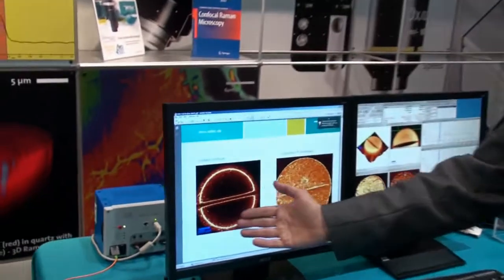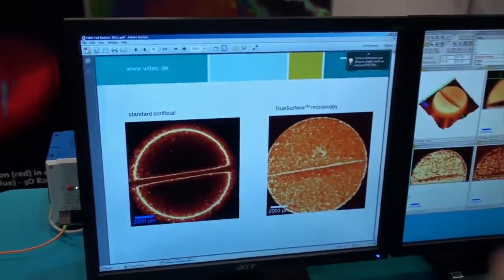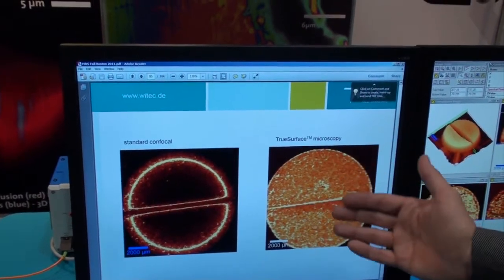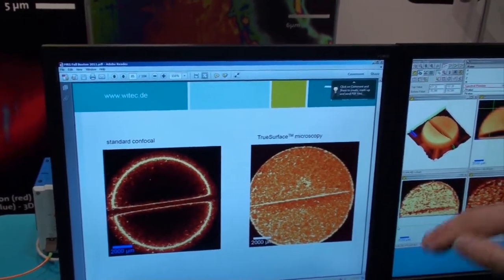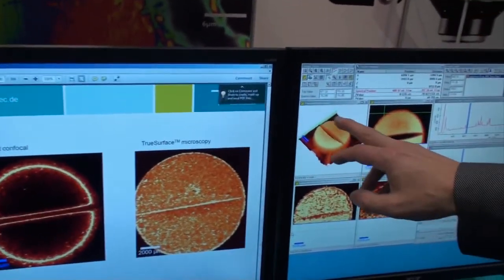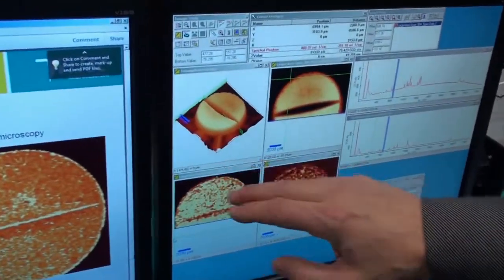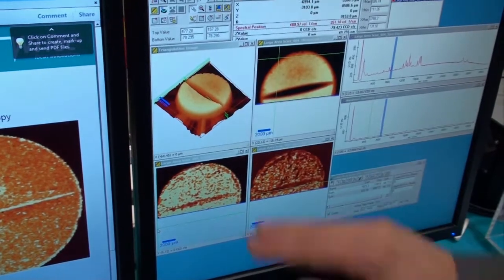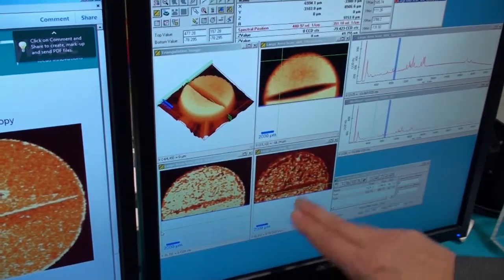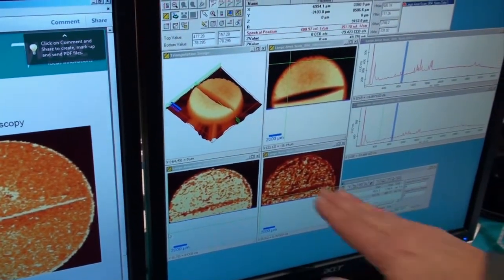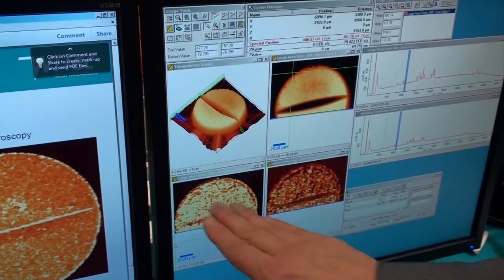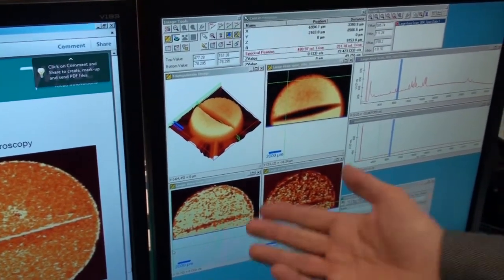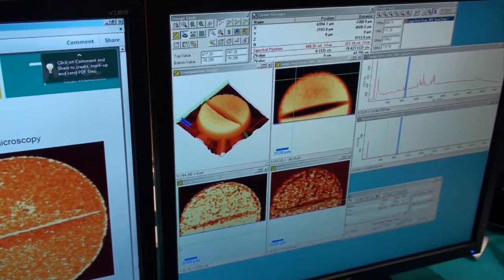If we compare the standard measurement with the True Surface measurement, you can see that — given the topography we measured before, which has about 500 micrometers of topography — in the True Surface images you are always in focus. We get information from different chemical species in the tablet, and you can see you're always in focus.